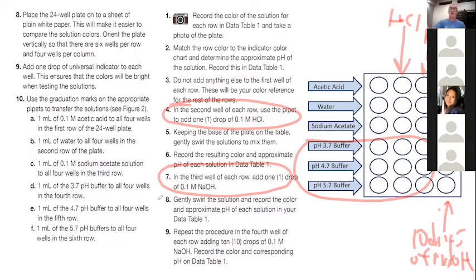We should see dramatic differences with the water because the water doesn't have any capacity to buffer. So the water should just be changing pH all over the place. The HCl should really, really reduce it. The NaOH should really, really increase it.